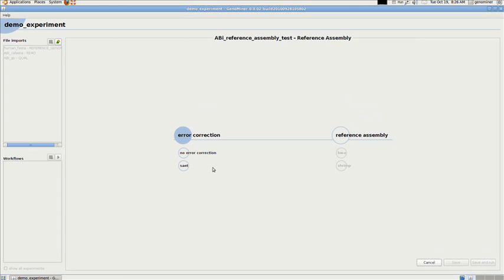The next step is to define the modules of the workflow you have chosen and set their parameters. Modules are the tools of workflows that are used for error correction, reference and de novo assembly, or ChIP-seq data analysis. The next step is called error correction. If you want to run GenoMiner with Illumina or Roche sequencing data, you need to skip this module step. As we work with ABI Solid files in this example, we click on SAET to perform the error correction.